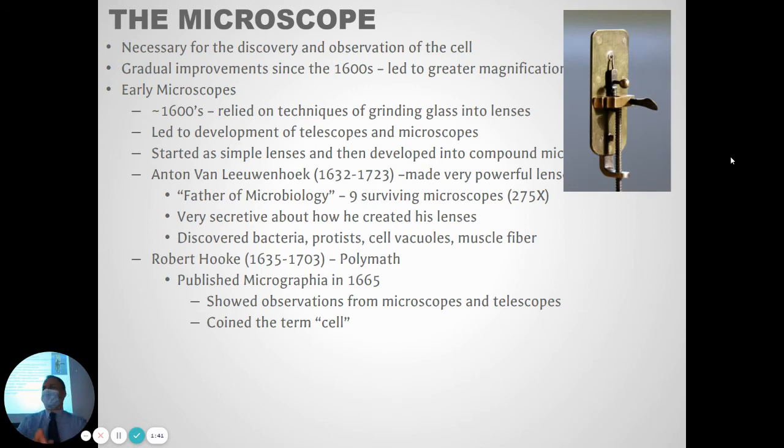The first microscopes looked kind of weird compared to what you would imagine. This was one of the first microscopes, this picture here. What is this thing? How would you actually use this? Why is it made of metal?